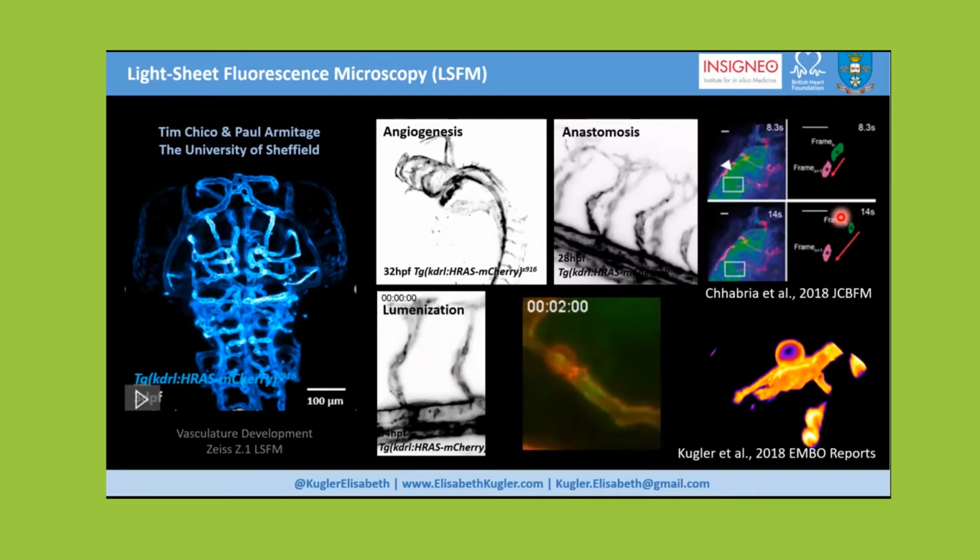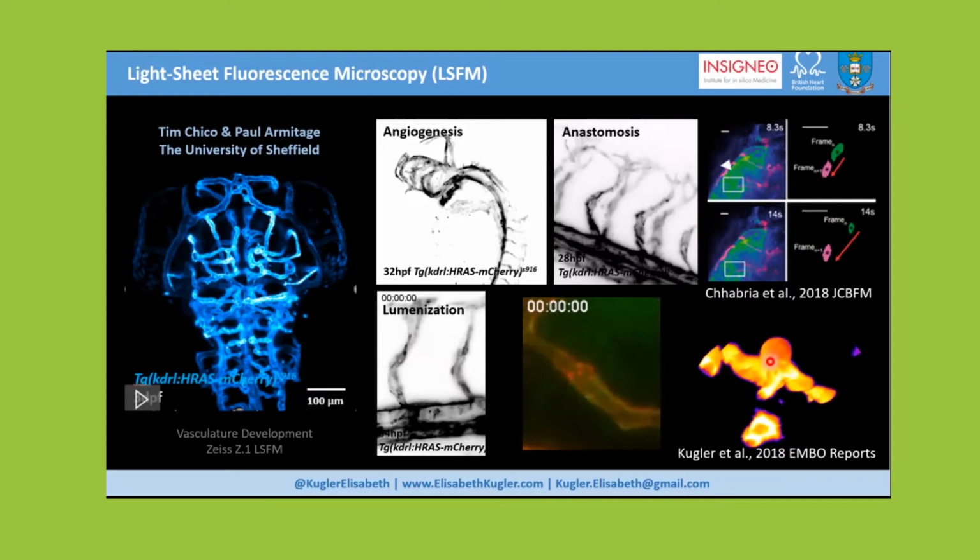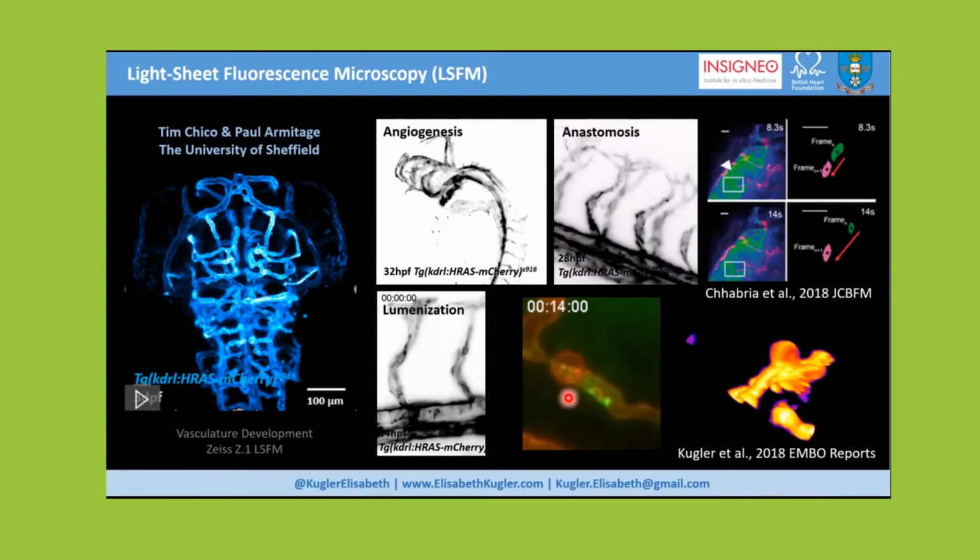And the other process that we were able to discover and describe is a membrane behavior that hasn't been shown before, which is called Kugeln. Kugeln is the German word for sphere. As you can appreciate, these cells are very ball-like or sphere-like, and they sit on top of these vessels, and this is why they're called Kugeln. These structures are highly dynamic. If you look at this time-lapse here, you can see two of them. They protrude from the parent vessel and form this ball-like structure. Then some of them change their shape, others maintain their shape, and then retract back into the vessel.